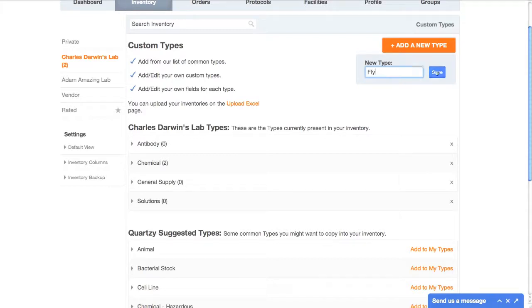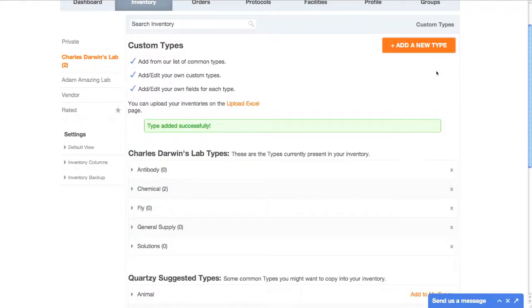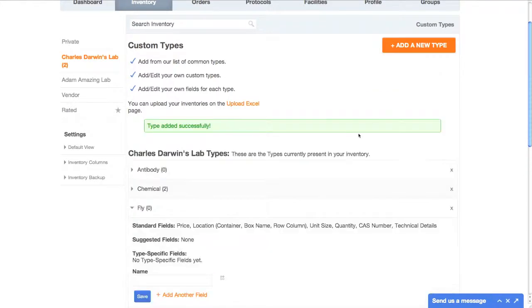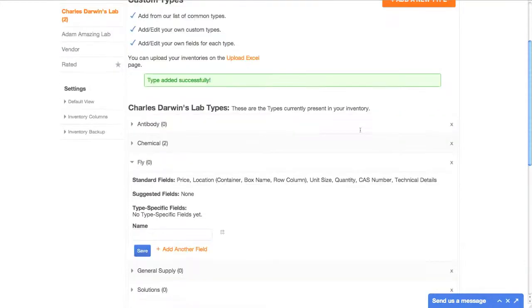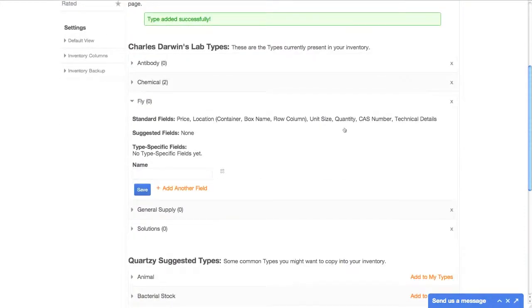Our suggested types have common fields associated with them, but if they don't meet your needs, you can add your own fields to each type so you can track the information that you care about.